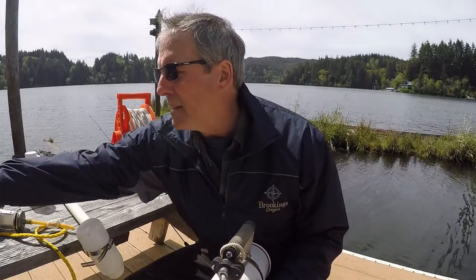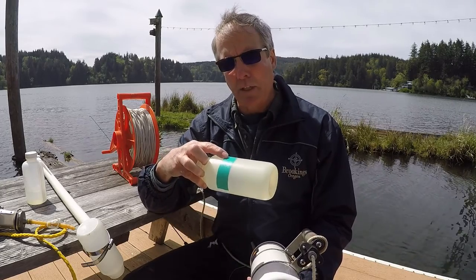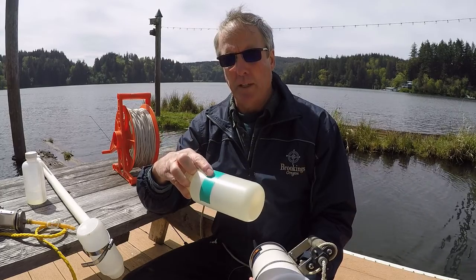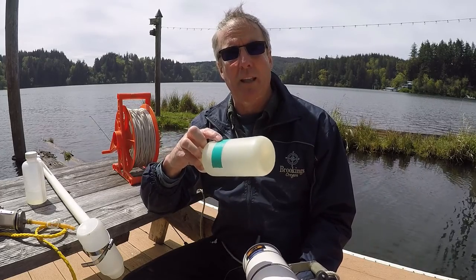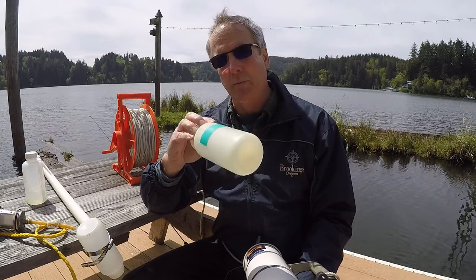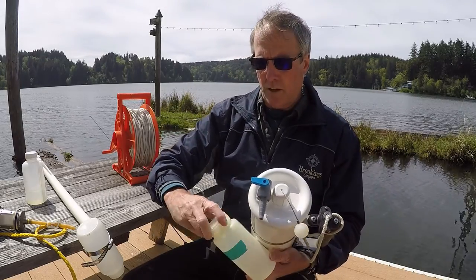You would just get a bottle like this. I've got a piece of this special kind of tape that we use. This is real easy to write on, and we would label the date, the time, the site, and what it is that we want to have analyzed. So nitrogen, phosphorus, or nutrients, or something. It just depends upon what you're looking for. So that's the label. So you would label it, and then just open it.